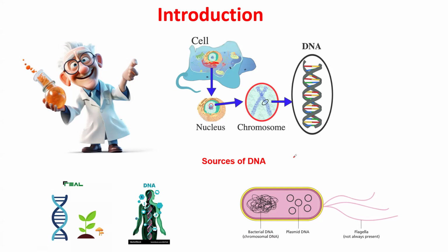So these are some of the major sources of DNA. We usually isolate DNA from humans, and we get it from bacteria. You can even get DNA from viruses, because we have DNA viruses. So these are the sources of DNA.